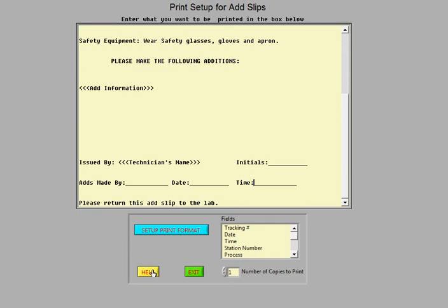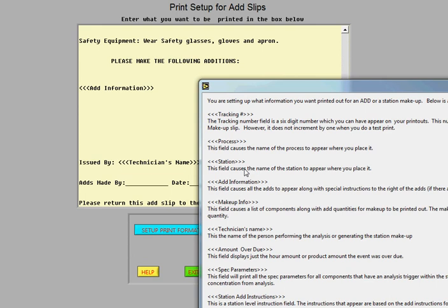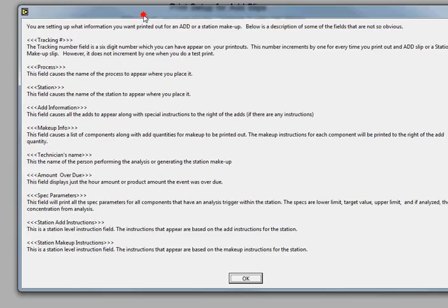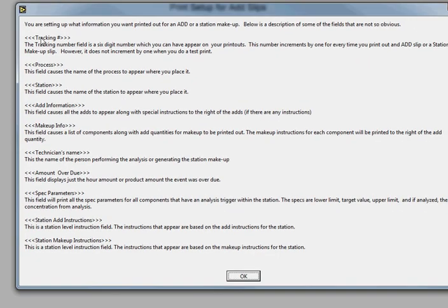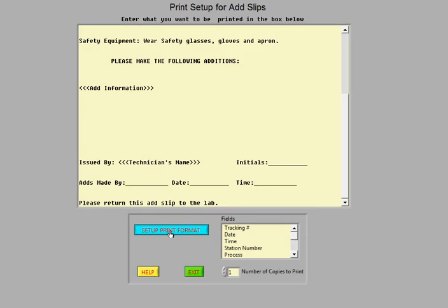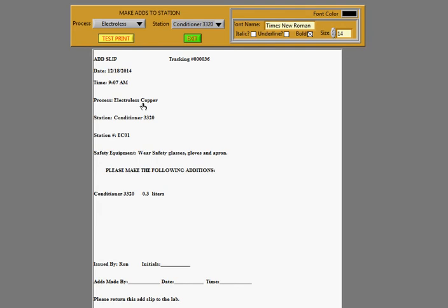It's nice to look at the help screen if you want to see what all these fields are that you can use with the triple brackets around them. And you can actually look at the report preview right here. And it just shows you what it will look like when it prints. You can do a test print also.